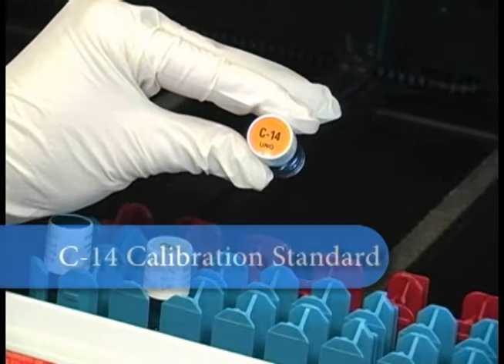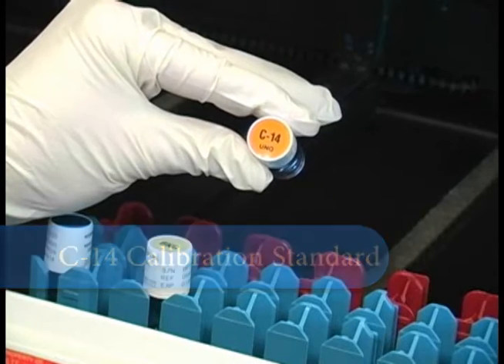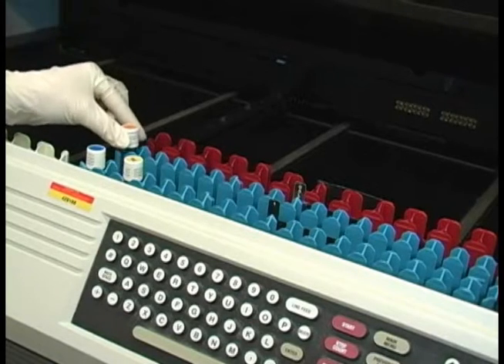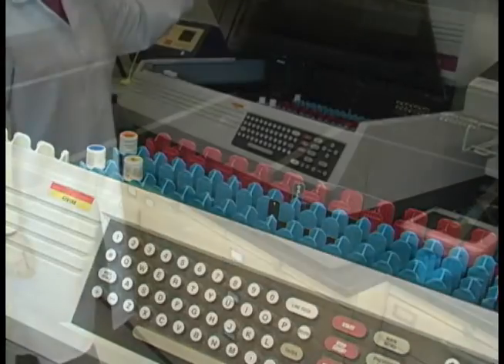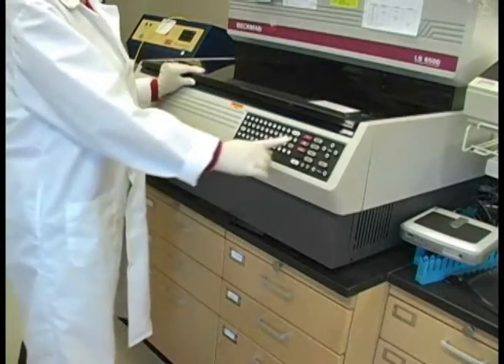This is the carbon-14 calibration standard. Put it into the calibration rack and we simply close the lid and press the Start button. This should then do a calibration for you.